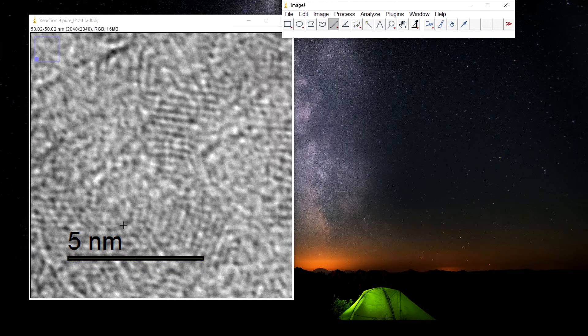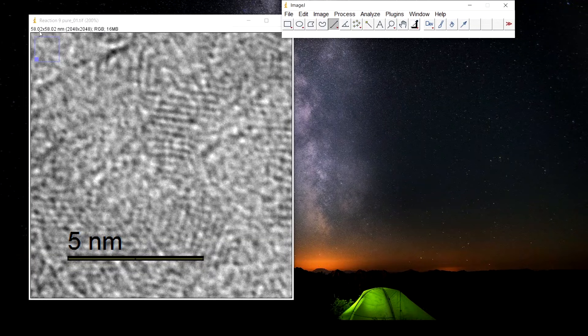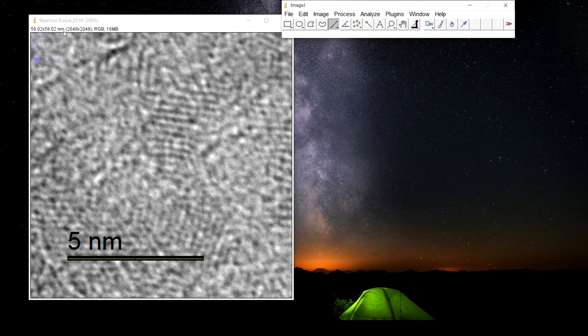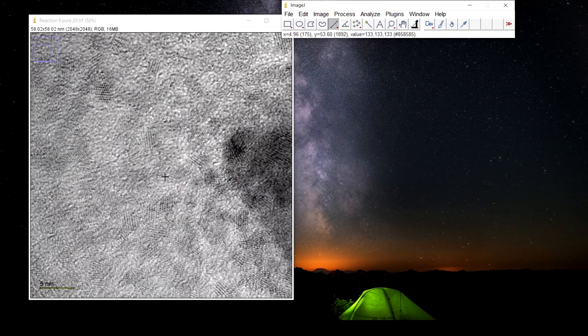As soon as we set the scale, we can see the dimensions of the image are in nanometer now. Now press minus to zoom out.